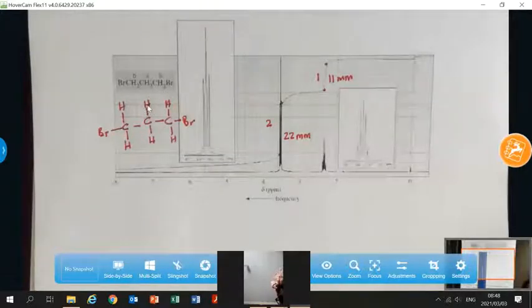Right, so you can see this hydrogen here is not different from that because this hydrogen is next to this carbon and this group. It's next to that carbon and that group, right? And this hydrogen is next to the same thing, next to that carbon and that carbon and the group. And we can't tell apart 2 hydrogen atoms. They are equivalent, right? It's like telling apart 2 identical soccer balls, which are white and have 1 dot on them. You can't actually tell apart the 2 soccer balls, right? So these 2 hydrogens for all intents and purposes are equivalent.